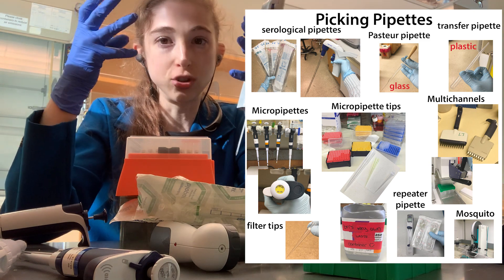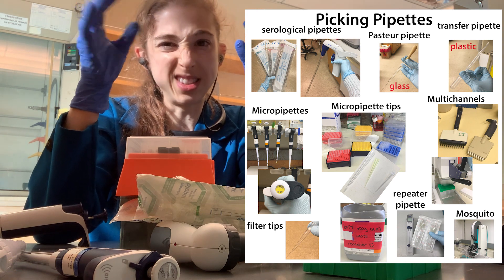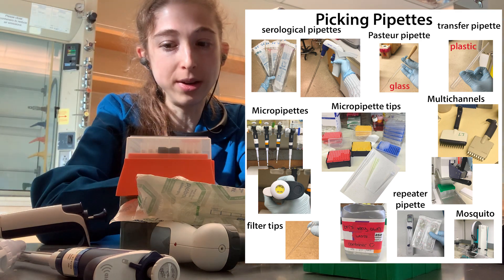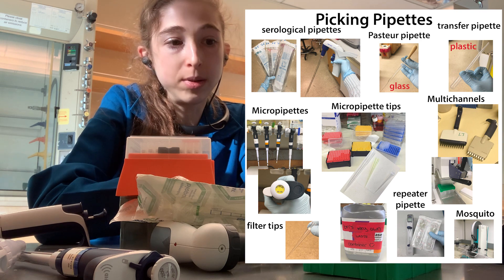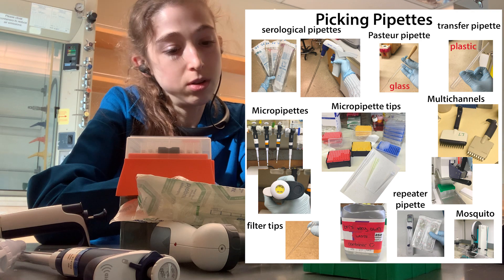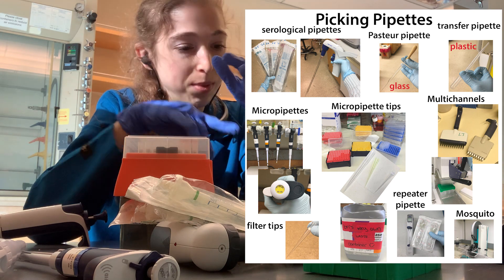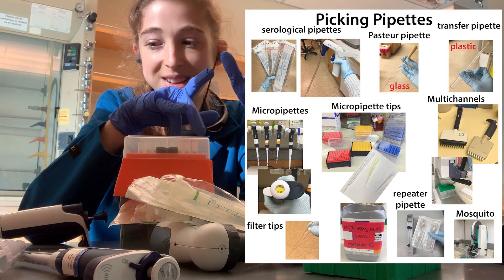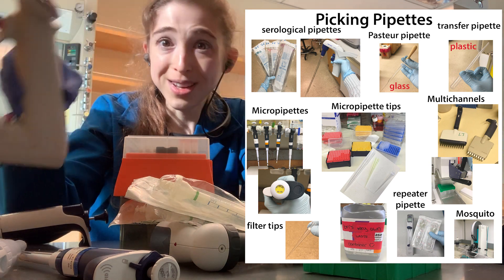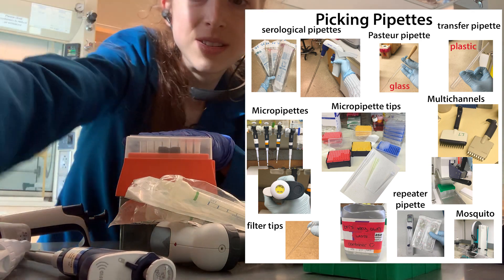You also have your classic Pasteur pipette — the glass ones with a little bulb. You can use bulbs with bigger pipettes. There are transfer pipettes, which are small plastic ones you're not actually using to measure, just to transfer liquid from place to place. These are the pipettes we use all the time in the lab. I discovered pipette-men in undergrad, the multi-channel in grad school, and the expandable one here as a postdoc. Hope that helps someone — have fun in the lab!